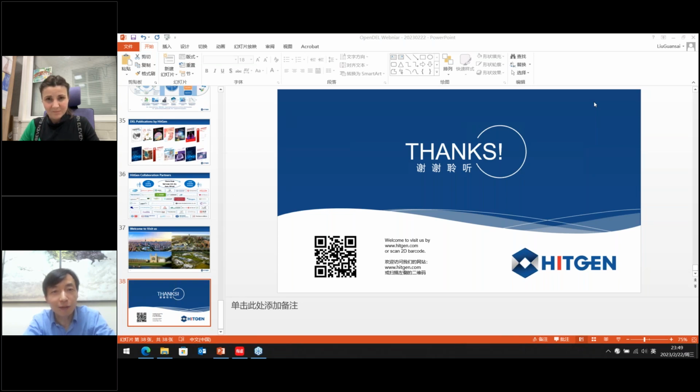For the DNA tag, it's quite simple because we use 100% assembly, using gel imaging to monitor that all of the DNA tags are added. The last thing is that we also use next generation sequencing for all the libraries to see whether we can find all of the DNA codons as expected with the designs. Yeah, thank you very much.